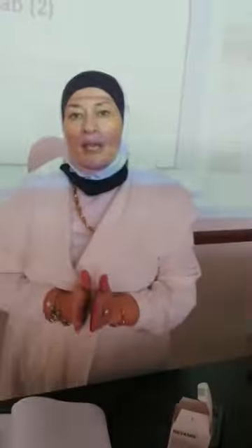With our experiment, which is determination of the dissolution of solid dosage form, we will make the dissolution profile for paracetamol tablet 500 milligram using dissolution apparatus 2, which is paddle type. And we have dissolution apparatus 1, which is basket type. The required dissolution apparatus is determined by USP.